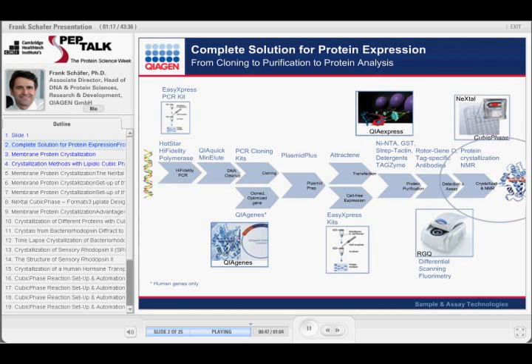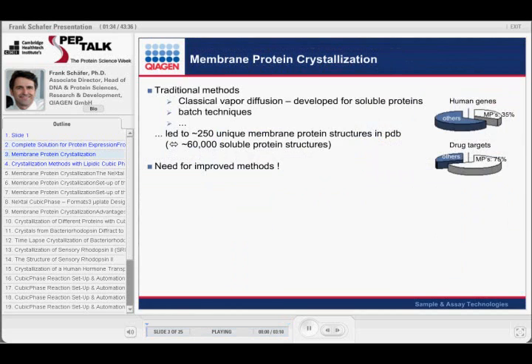And I would like to make one point. We are consequently using optimized constructs today, optimized with respect to codon usage, secondary structure avoidance and things like that. And that seems to work quite well. And I will come to that later as well.